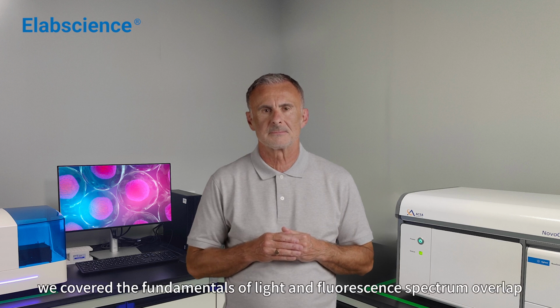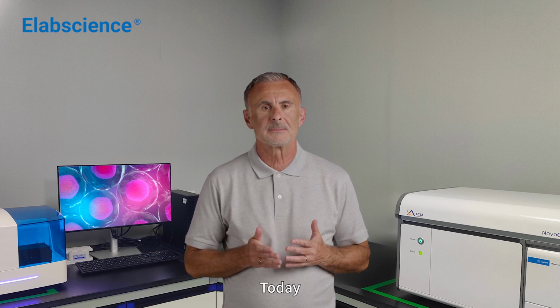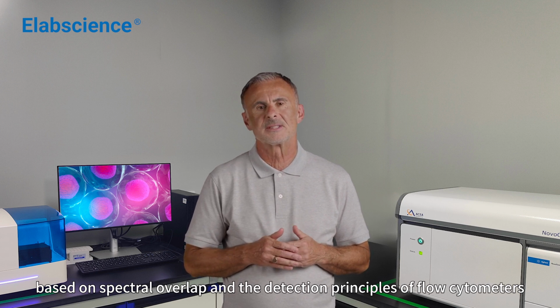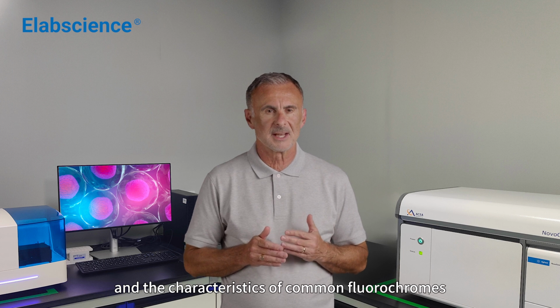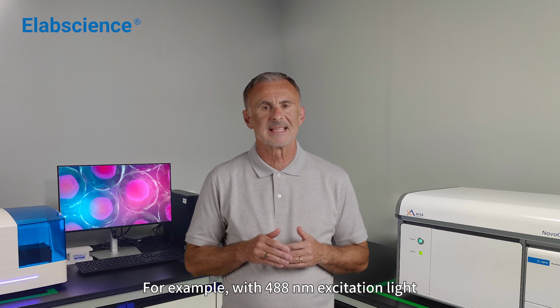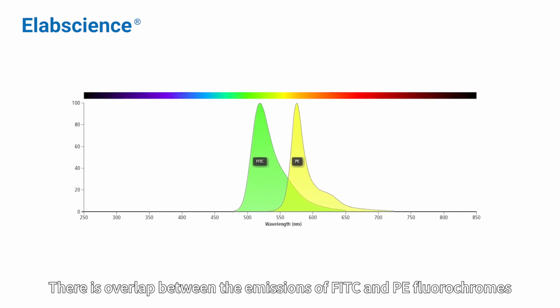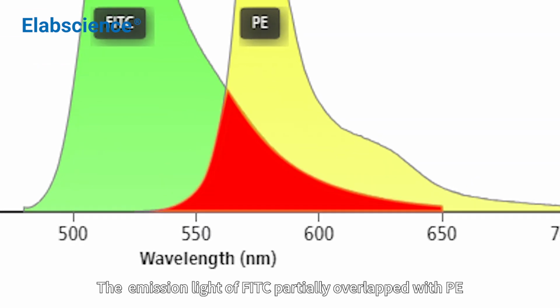Previously, we covered the fundamentals of light and fluorescence spectrum overlap. Today, based on spectral overlap and the detection principles of flow cytometers, we'll discuss fluorescence compensation and the characteristics of common fluorochromes. Fluorescence spectra often overlap. For example, with 488 nanometers excitation light, there is overlap between the emissions of FITC and PE fluorochromes. The emission light of FITC partially overlaps with PE.